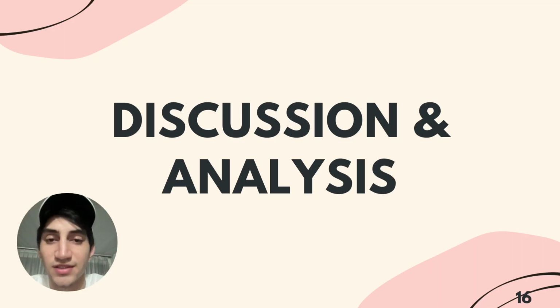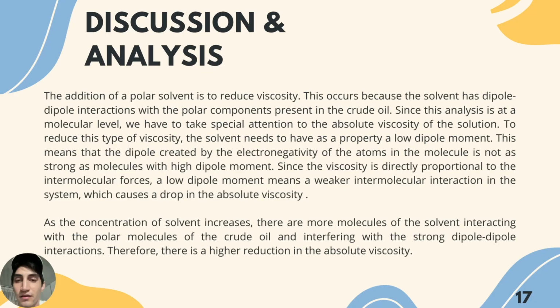Now we will proceed to discuss and analyze the results obtained. For this analysis, we will start by looking at the effect of adding a polar solvent to crude oil. We do this mainly to reduce the viscosity of the system. Why does this happen? Because the solvent has a dipole-dipole interaction with the polar components that are present in the crude oil. Since we're only looking at the molecular level of the system, we'll take into account the absolute viscosity.